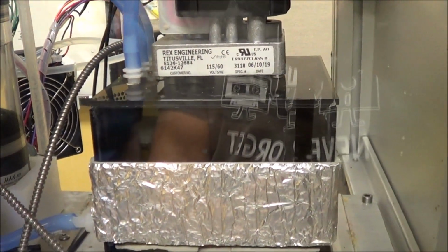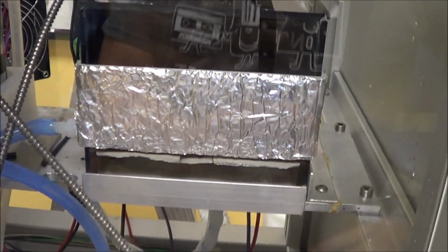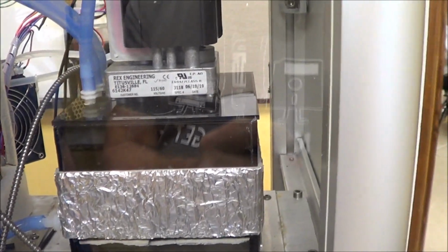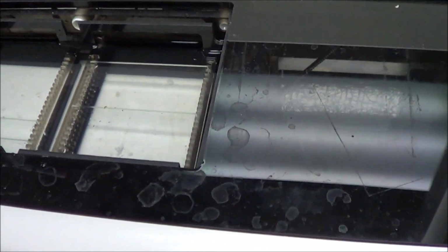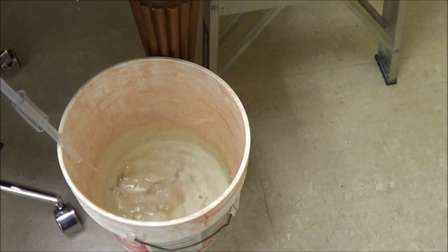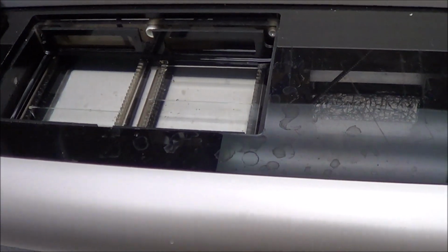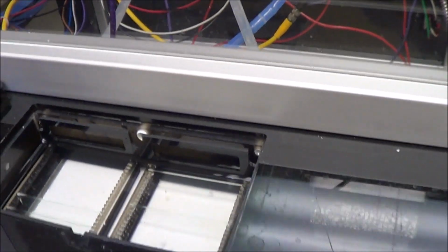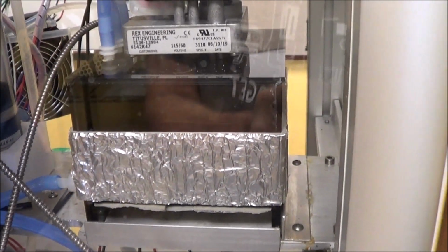And in the meantime, we're filling the DI water in the cooling tank. Okay, so in this case we're going to have to wait again for the tank to fill before it stops. After 30 seconds of lysis, we're emptying the lysis tank, or the process tank. And that pump is just dumping to a wastewater collection outside of the machine. That pump's also going to run for 2 minutes to ensure that the tank is empty. In the meantime, the DI water is filling the tank and cooling down to the process temperature.